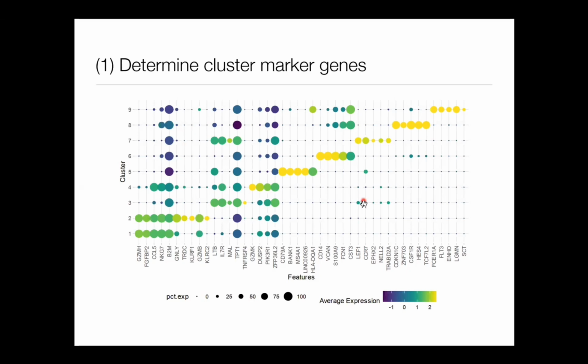First, the plot is generated in R, and the analysis behind is with Seurat, and they have some functions to find cluster marker genes. Here, I think I used a Wilcox test where I test which genes in cluster 5 are differently expressed than in all the other clusters. And then I pick the top 5 per cluster and I visualize them, okay? Now, what's the statistics to say this is a good cluster?